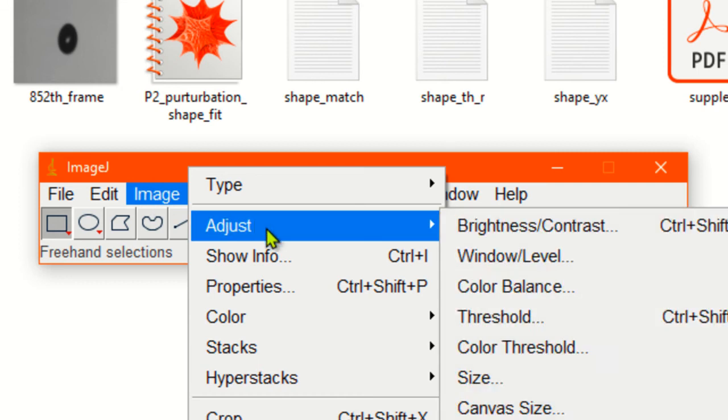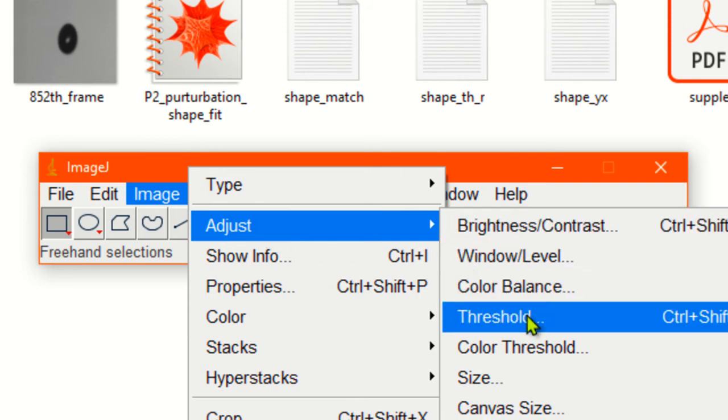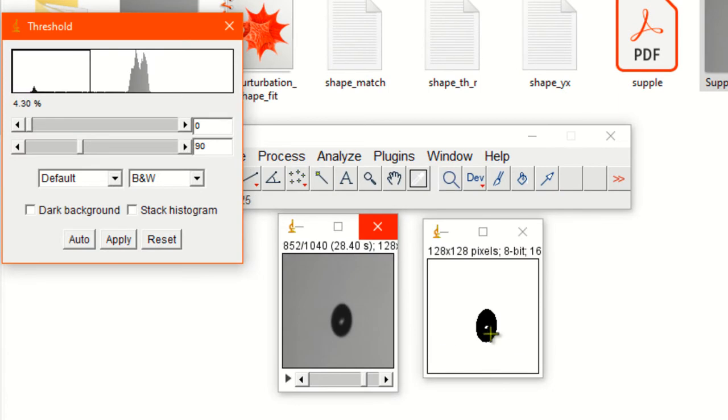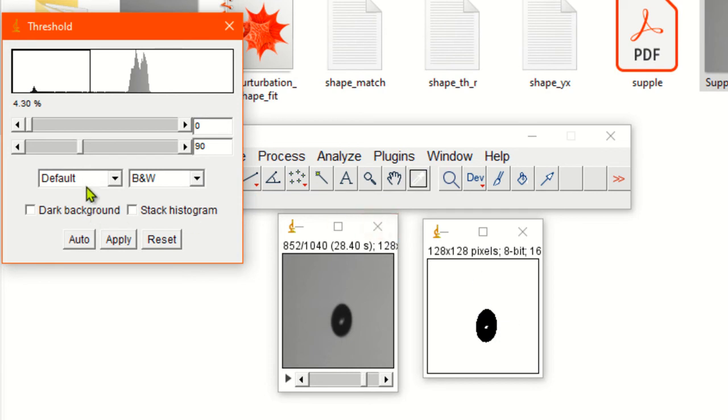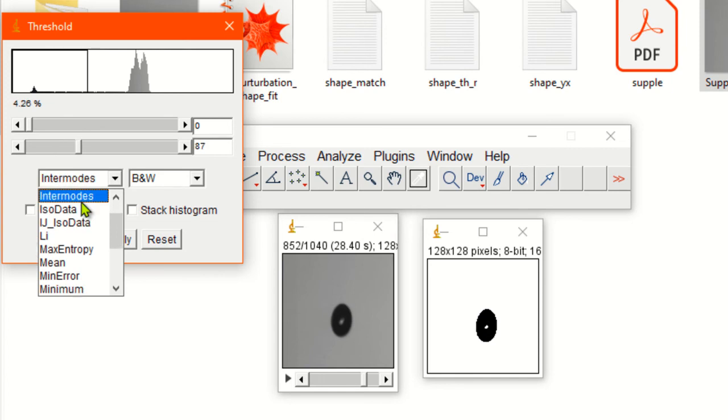Now in the second step, you can see we have two options. I'm just adjusting it a little bit so that you can see. Let's go to threshold.